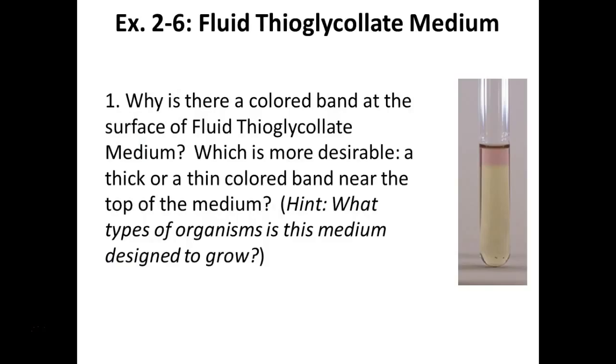So why do we want, or what is more desirable, thick or thin? Thin, right? And that, again, means that only a small amount of oxygen has diffused back into this tube. Remember, these aren't sealed cap tubes that we're using. Oxygen continues to diffuse. That's why, even though I refrigerated them, especially yours, it grew really far down into her tube because the oxygen kept diffusing in. I tried to slow the growth as best I could by putting it in the refrigerator. But typically you would read these the very next day. And we refrigerated them the very next day, but that was 2 weeks ago.